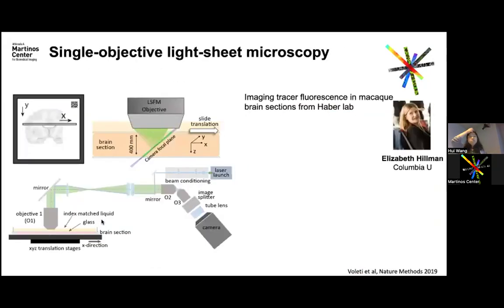Okay, so with light sheet microscopy, we can actually see individual axons with much higher resolution. This specific setup, called SCAPE light sheet microscopy, uses a single objective with a tilted imaging plane and collects fluorescence in this tilted plane.